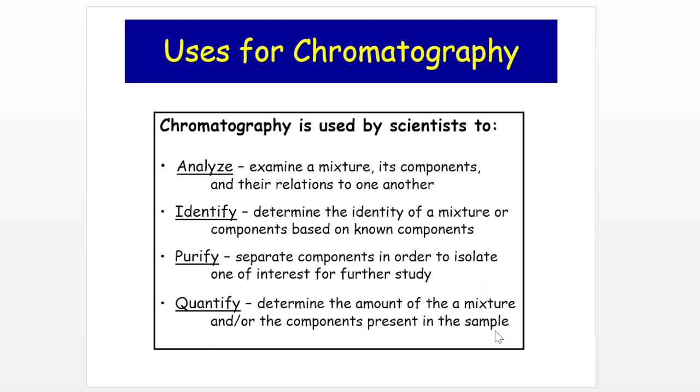Let's come toward the uses of chromatography, where we can use chromatography. Chromatography is used by scientists for several purposes, some of which are discussed here.